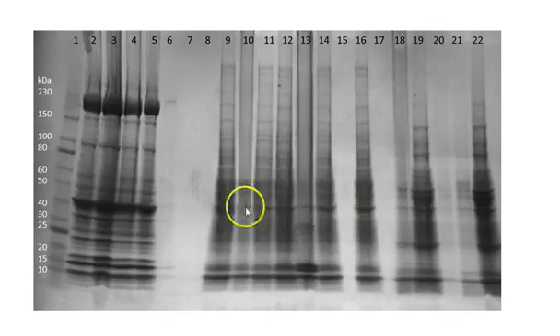They're all the same, so you can just talk about your homogenate. You don't need to talk about your lane in particular. You just want to talk about the homogenate.